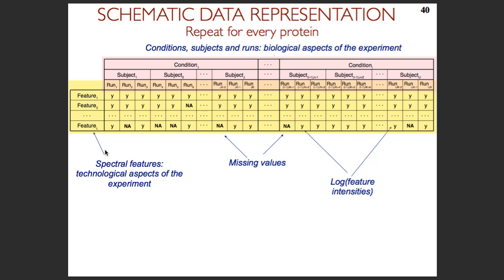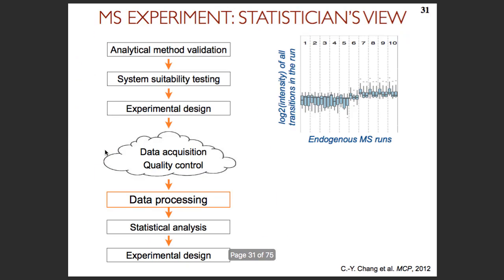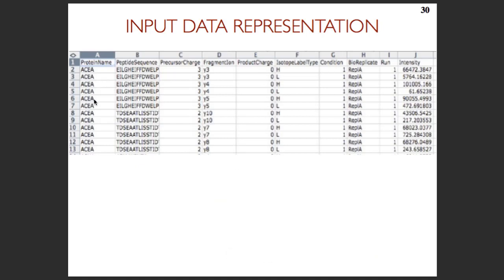By the way, if for some experiments it's meaningful to do peptide level quantification, for example, because you're particularly interested in post-translational modifications or something like that, we can essentially trick MSstats, and instead of protein names, give peptide names. So let me just show you here. Here we have protein name, right? And these are different peptides. So just add another character, another symbol or something, so that MSstats thinks that this is one protein and this is another protein. And then we can do peptide level quantification.